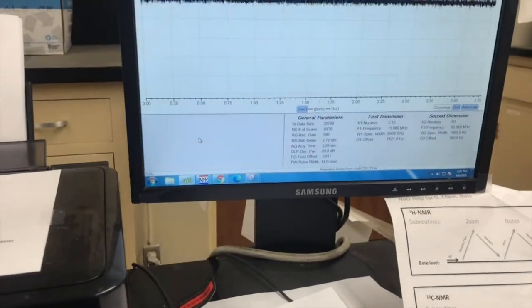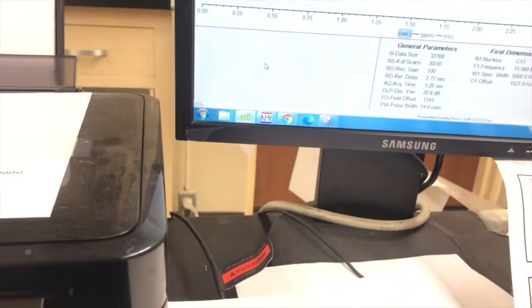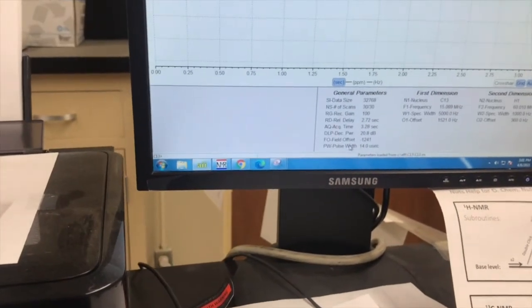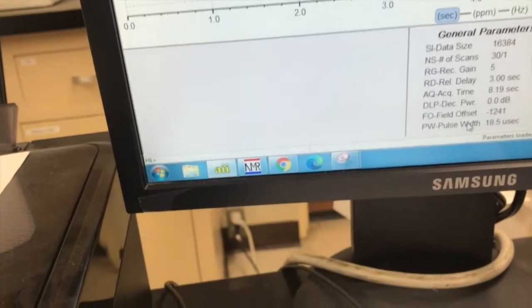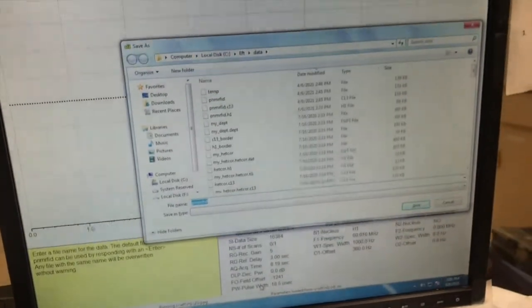I'll go to the NMR software, and you'd think I just go right and run the carbon first, but I won't. I need to run the proton NMR first because I need to check to make sure if the TMS is still at 0, and to shim it if it needs it. This is a new sample really because of the more concentrated new solvents, so it's probably going to need to shim. So I want to switch to the proton NMR setting, and it's as simple as typing NU space H1 and then enter. Now we're in the proton NMR, and I'll rescan to check to see if I'm right. ZG, enter.